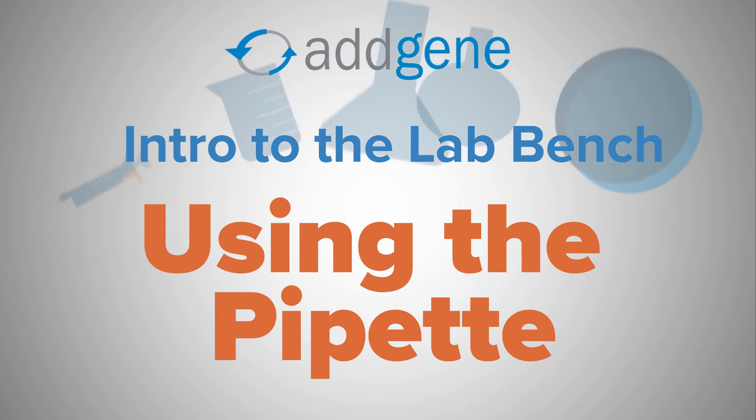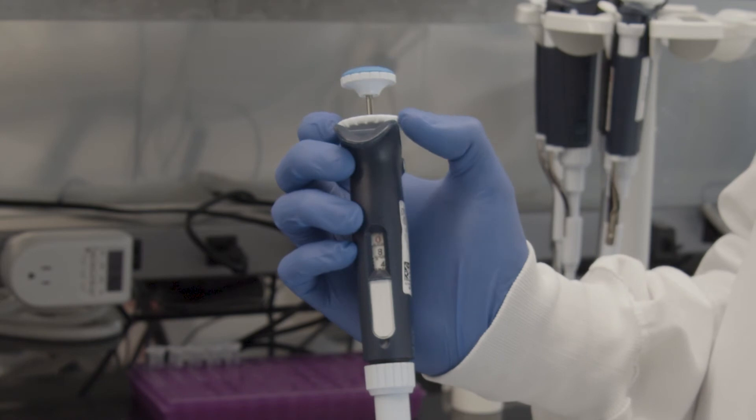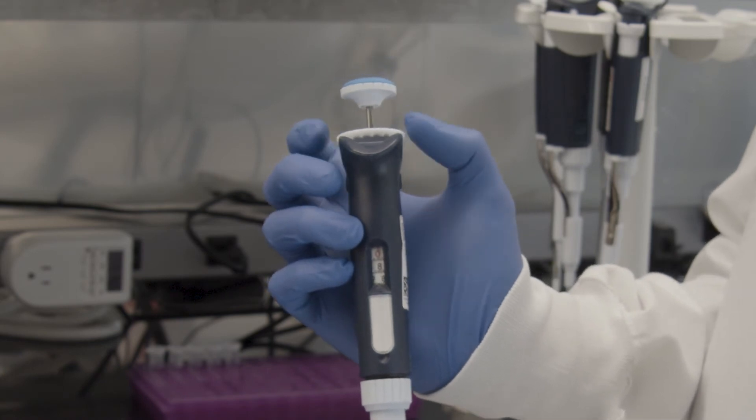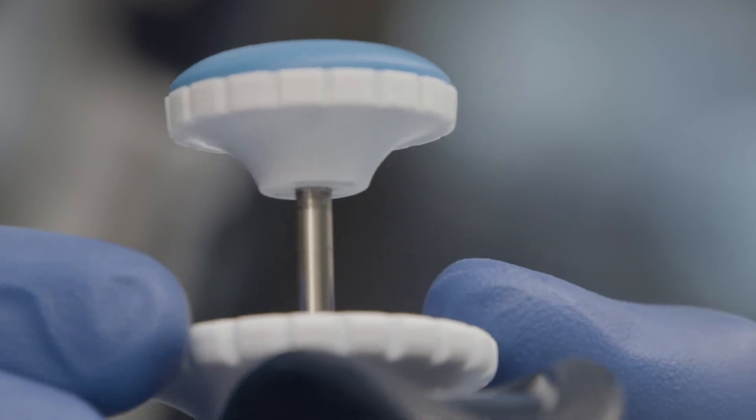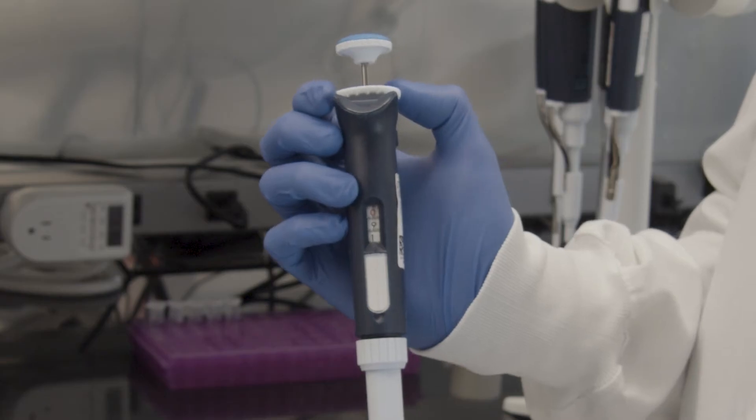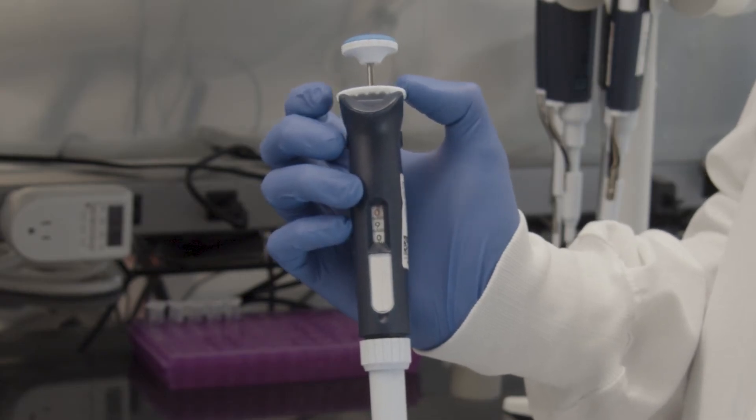Now that you're familiar with the pipette and tips, let's talk about using the pipette. First, set the desired volume of the liquid using the adjustment ring. It's often standard practice to go above, then roll the dial back down to the desired volume. On some pipettes, this can be achieved by rotating the dials behind the numerical display.